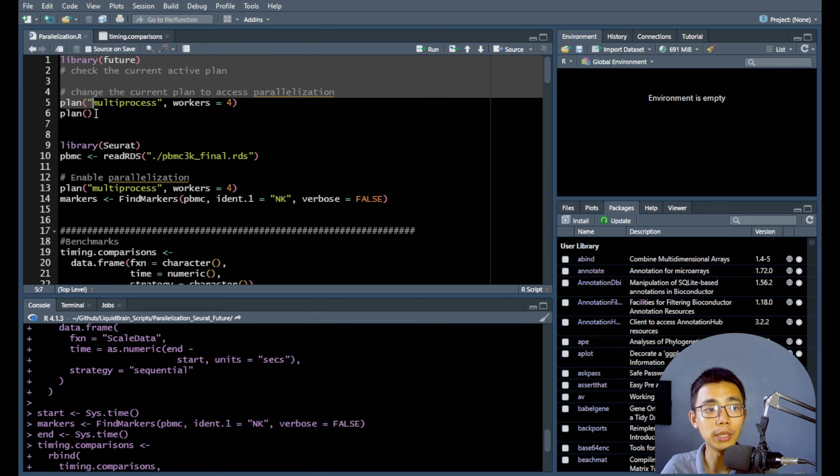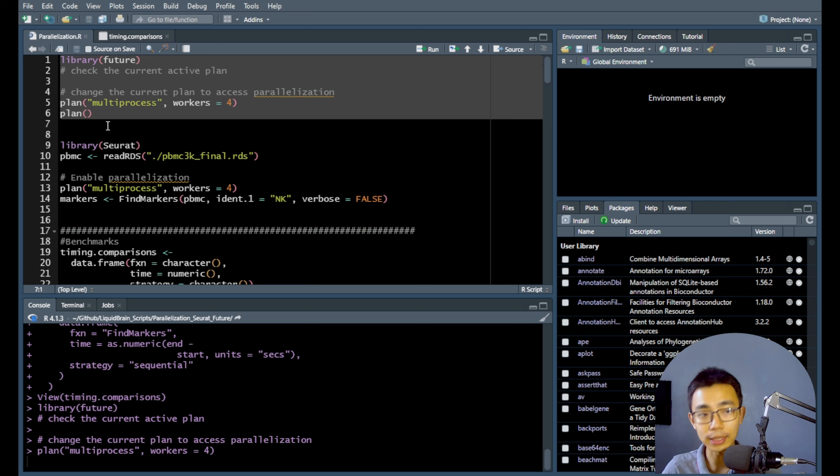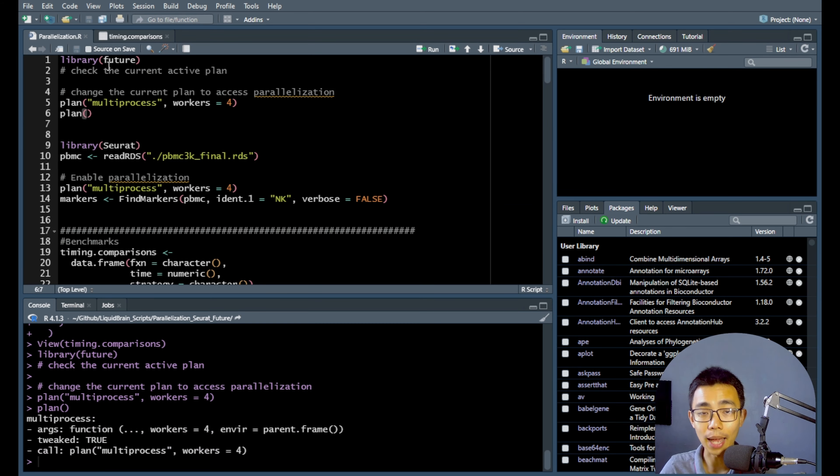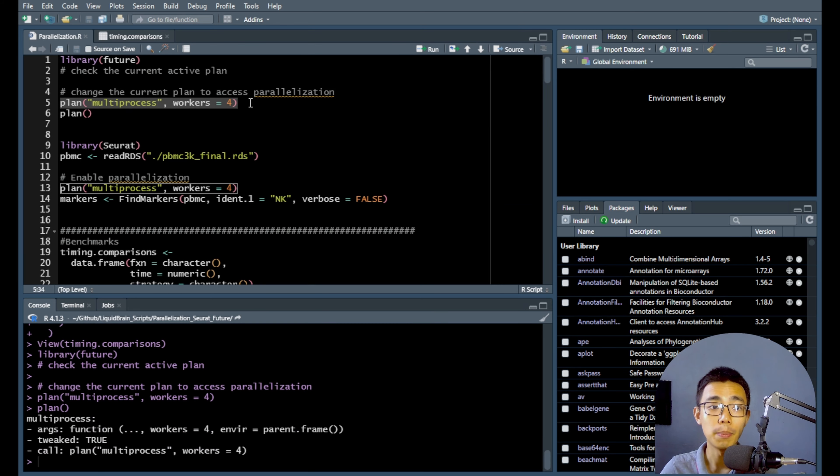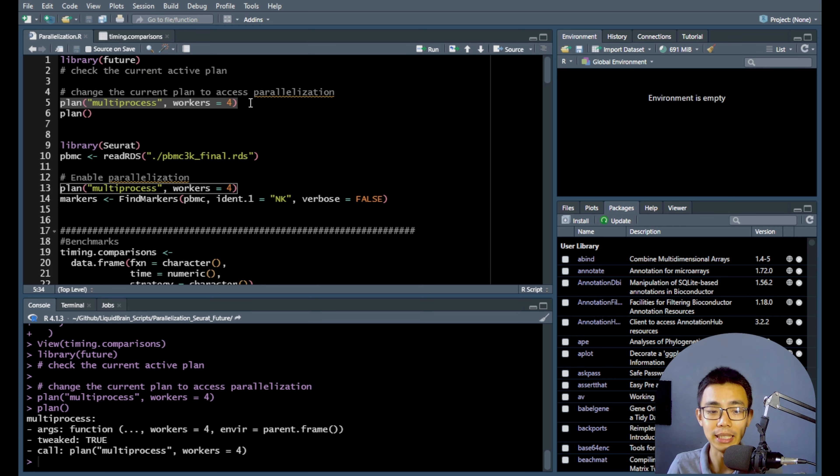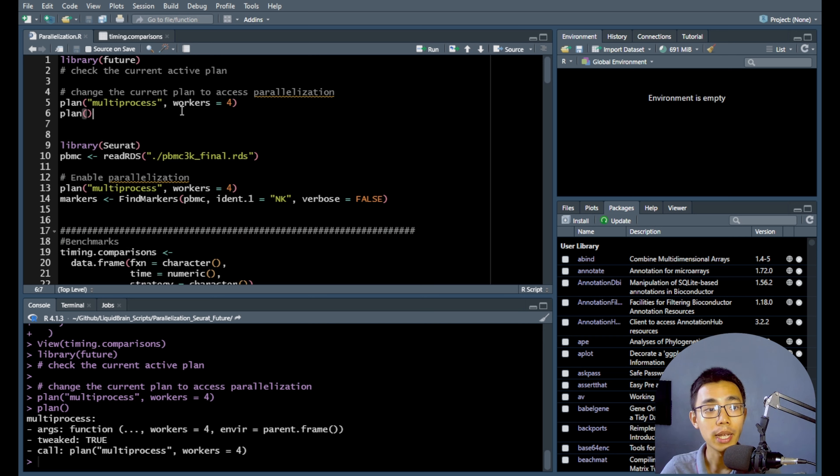So how does it work is that you just run, of course, a library command to load it into environment and run a plan multi-process and set the number of workers that you want to have. That's number of threads that you want to split into. So that's not core, that's thread. So you have to be careful on that front.